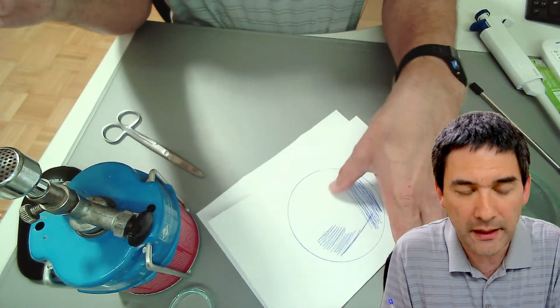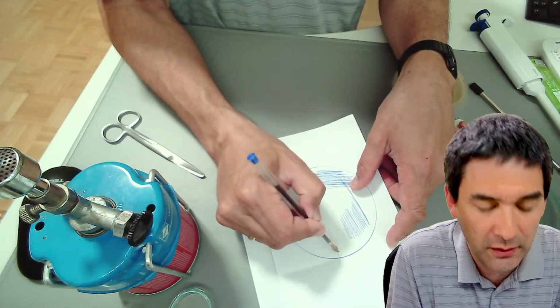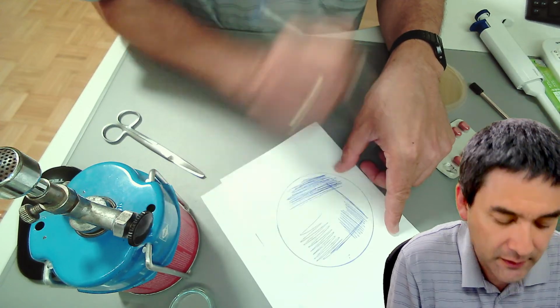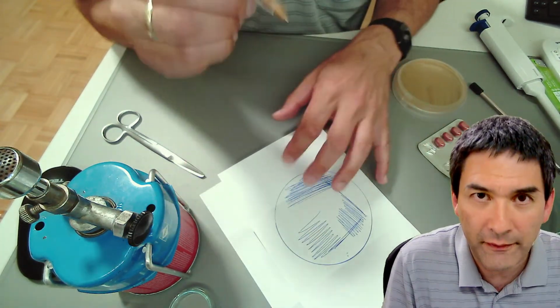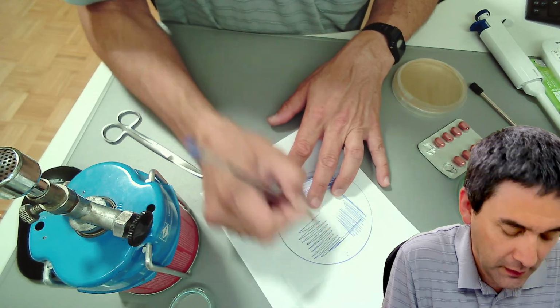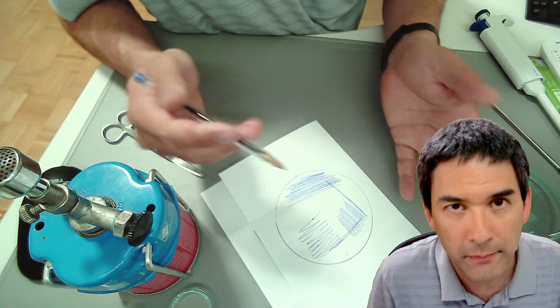Then I have to cool it down. So I'll be cooling it by putting the loop into the cold agar, and then I do it a third time. I streak across, and I will go like this. So I'm diluting the bacteria. What I will have at the end is individual bacteria over here, but I will not be able to see them because they are microscopic.